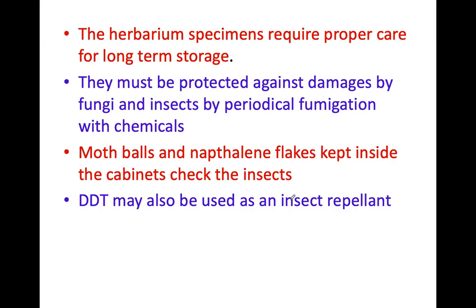The herbarium specimens require proper care for long-term storage. They must be protected against damage by fungi, bacteria, and insects by periodic fumigation with chemicals. Moth balls and naphthalene flakes kept inside the cabinet check the insects. DDT may also be used as an insect repellent.